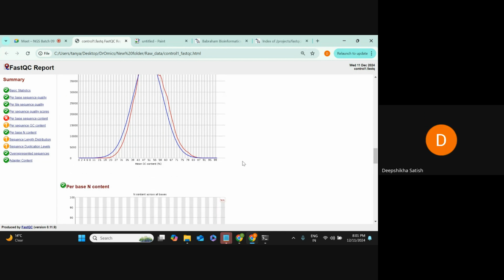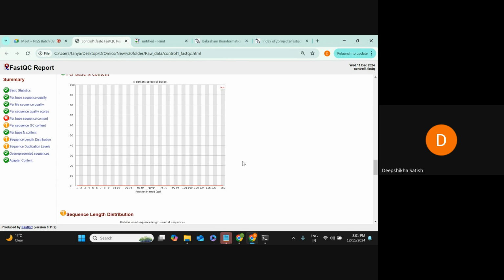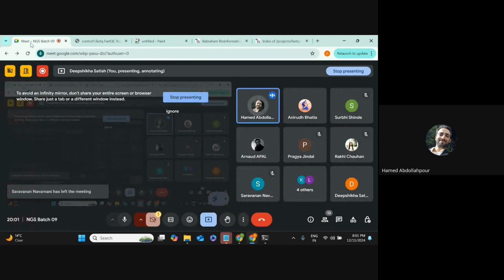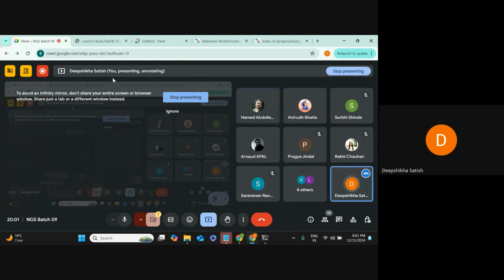Any one of you, if you don't understand, just tell me. Professor, if GC content is high, it means our DNA or RNA quality is much better. Yeah. Exactly. Exactly.